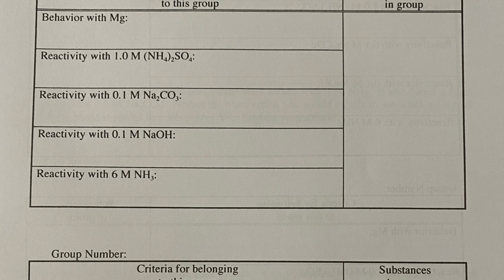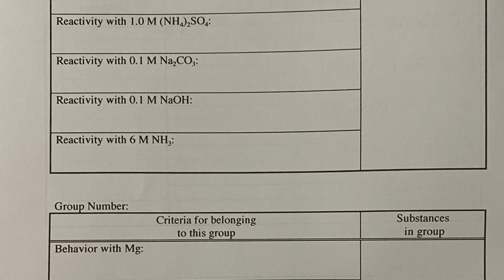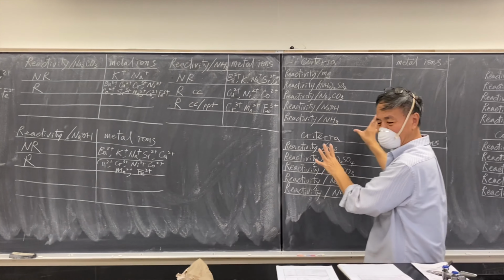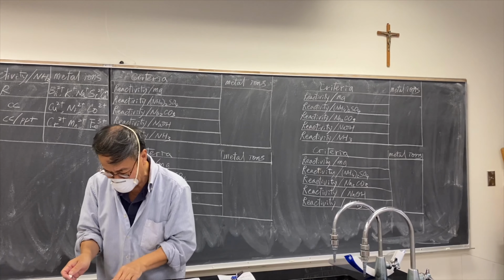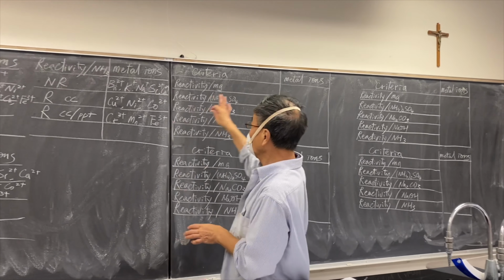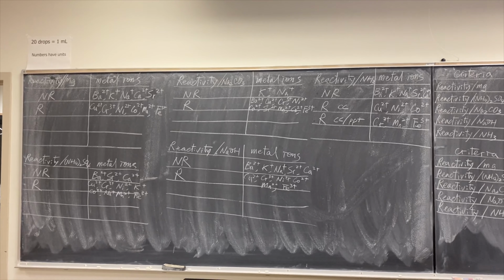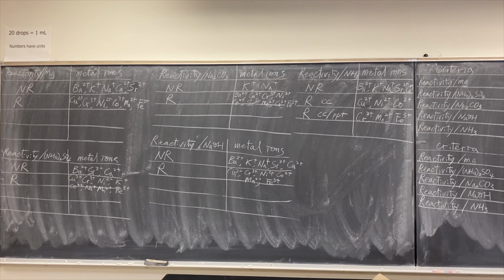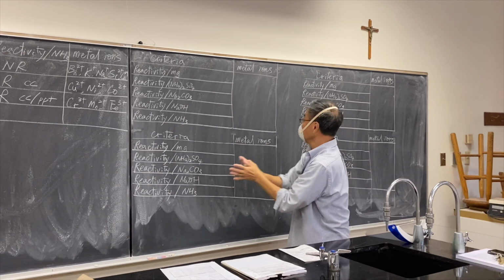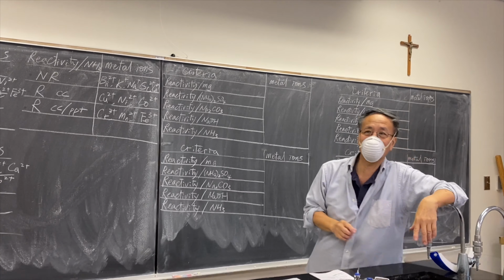So the next one. Using all of the chemical properties, we will now create one combined classifying scheme on pages 53 and 54. Move to our final table on page 53 and page 54, all right? So what we're going to do now is massage all 5 reactions into each and every final table.